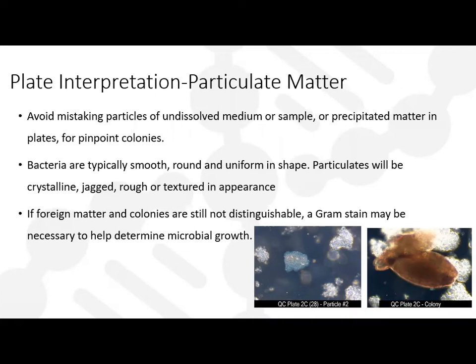And sometimes if you're unable to decide and the foreign matter versus pinpoint colonies isn't clear to you, a gram stain is definitely a good way to check it out and make sure that you're counting only bacteria and not mistaking that for any kind of undissolved particulate matter.